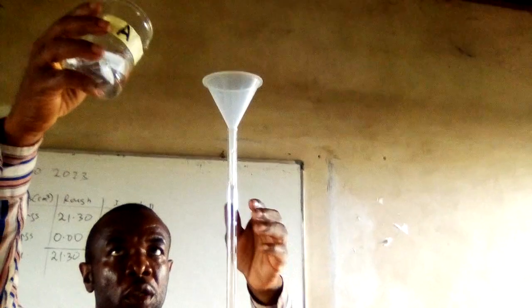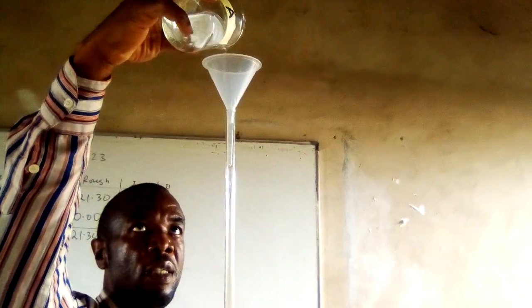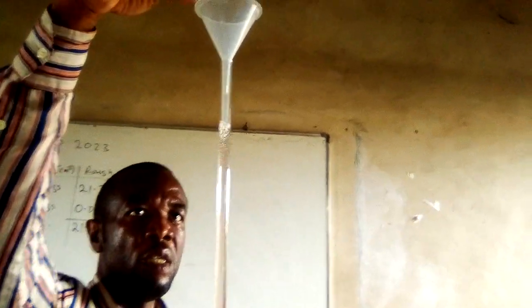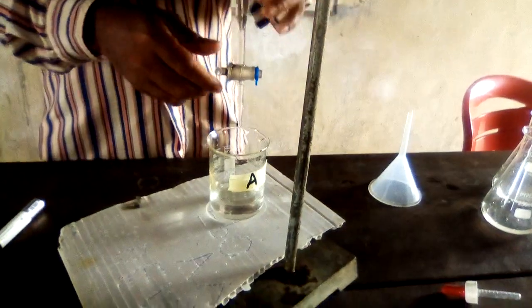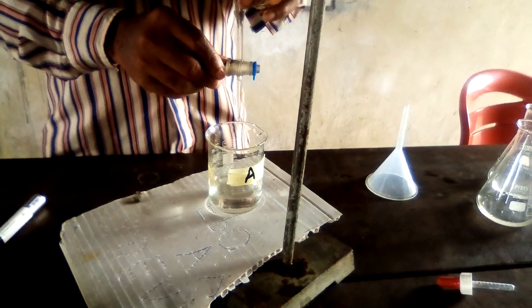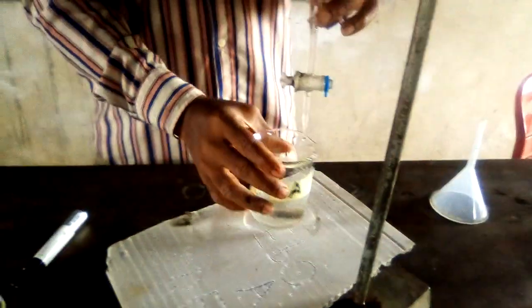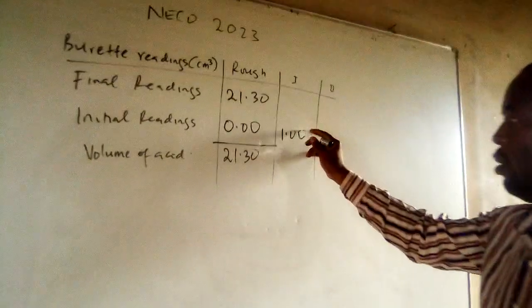For the first accurate titration, we add more acid to the burette. This time we start from a whole number — reducing the acid level to 1.00 cm³. The initial reading is recorded as 1.00.